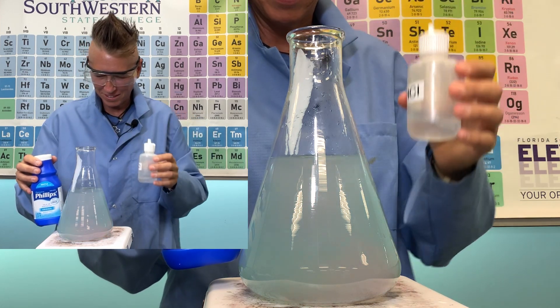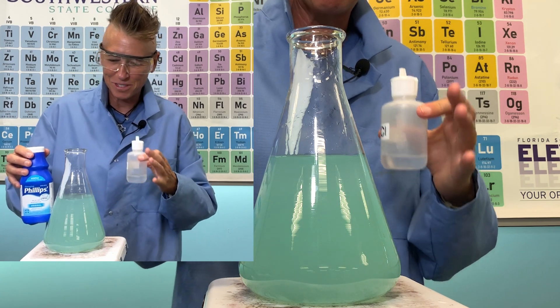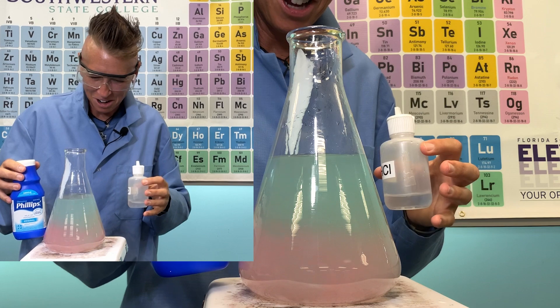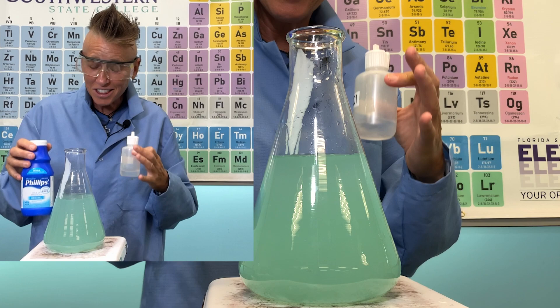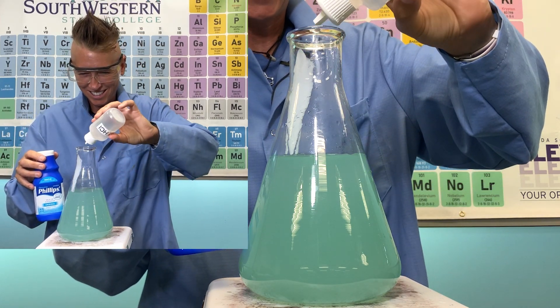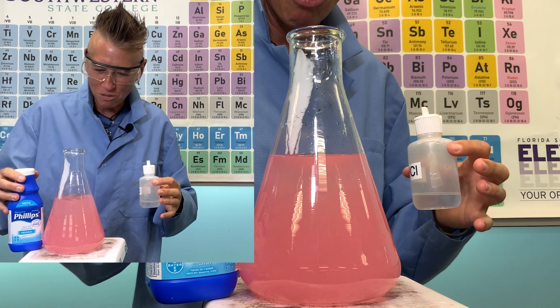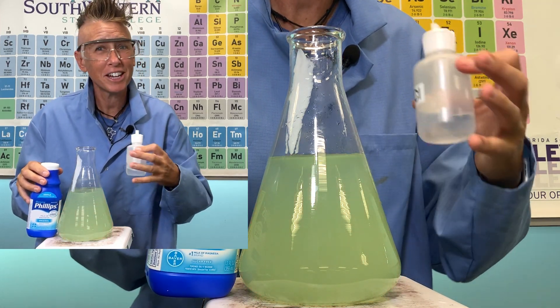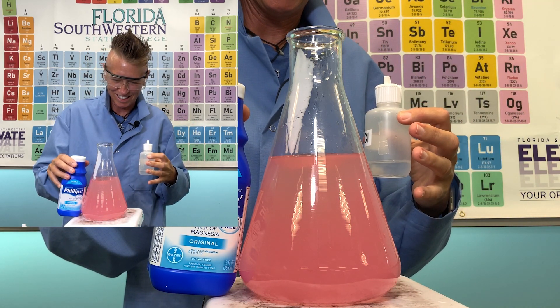As the hydroxide ions are consumed in the neutralization reaction, the equilibrium for the solubility of magnesium hydroxide is shifted to the right to replace the lost hydroxide ions. This means more solid magnesium hydroxide will dissolve to produce additional hydroxide ions. This dissolution of magnesium hydroxide helps neutralize the excess acid and is a key aspect of how the reaction progresses. The net result is that the initially sparingly soluble magnesium hydroxide becomes more soluble as the acid is neutralized.